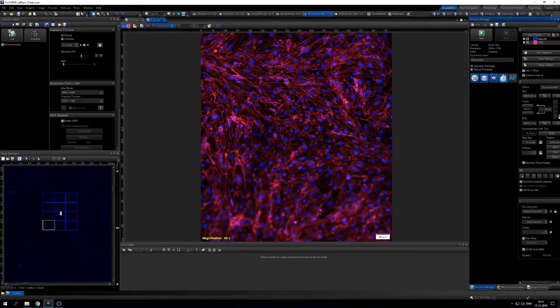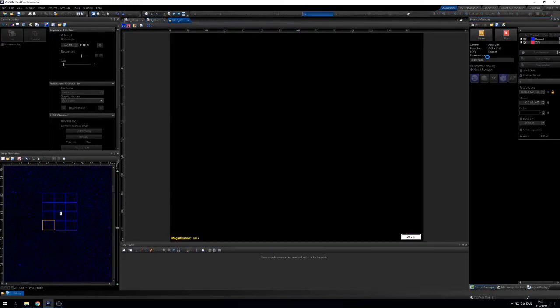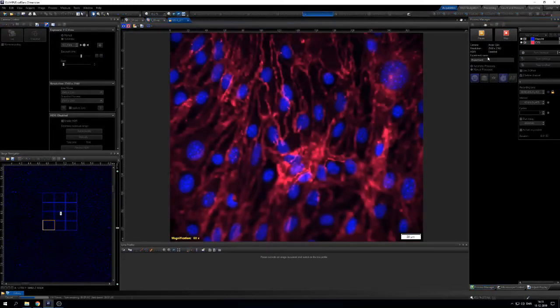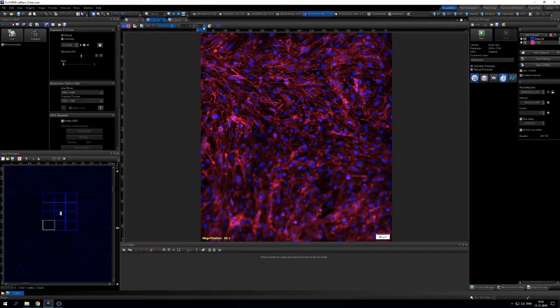You can also add a time lapse. It may not be very much used on this microscope because it doesn't have incubation, but you may have reasons to make a cycle of it and go through the positions or whatever kind of protocol you want to make. So this is exactly the same image acquired in the time-lapse loop. You can see here T is representing the time, so we have different channels too. Now we go to the other image we acquired just before.